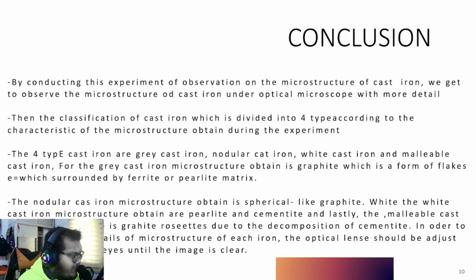In order to get the perfect detail of the microstructure of each iron, the optical lens should be adjusted accordingly to the eye until the image is clear. So that's all for me.